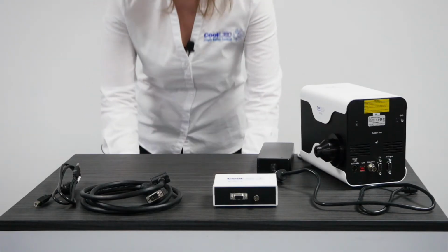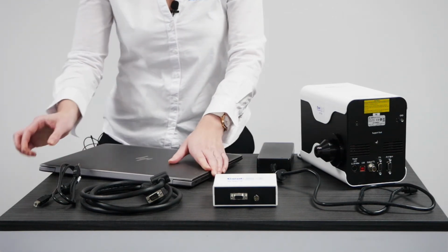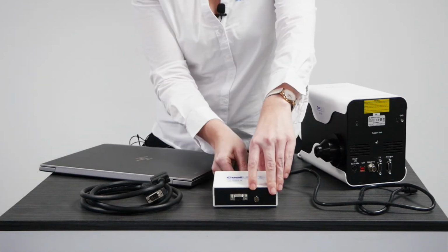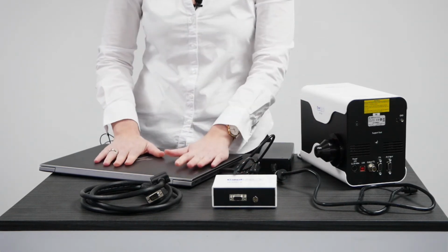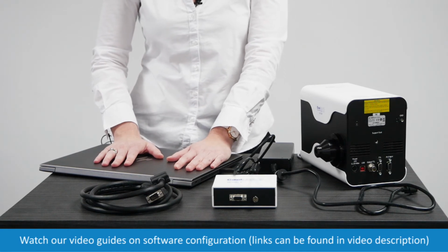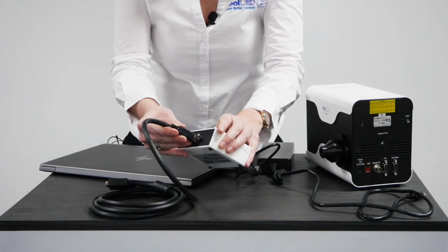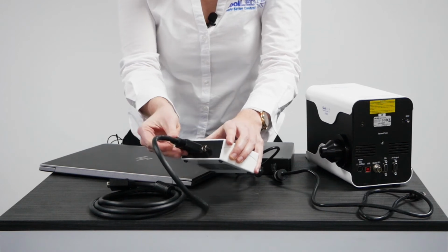First, connect the USB cable between the pE-6501-8 and your PC. Next, you'll need to download the National Instruments drivers, and we show you how to do this in our software guides, which can be found on our website. Next, connect the 15-way high-density cable between the pE-6501-8 and the pE-800.